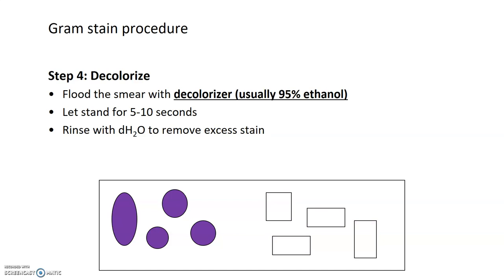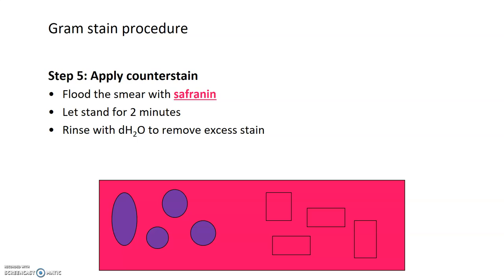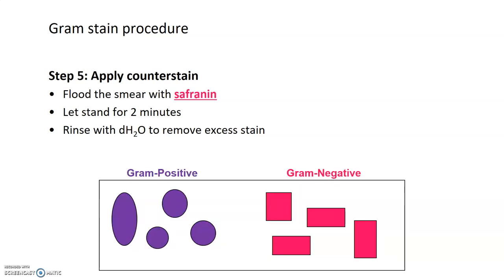At the end of the decolorization process, what you would expect is that some cells remain purple, your gram-positives, and any gram-negatives that you may have on the slide would be completely decolorized from the addition of the ethanol. The last step of the Gram stain is to apply the counterstain, where you flood your smear with that red dye called safranin, and you can let this stand longer to allow the counterstain an opportunity to get into any gram-negative cells. It can stand for about 2 minutes, and then you rinse off any excess stain with water, and what you'd be left with is your gram-positive cells, if they are there, in purple, and any gram-negative cells being pink.